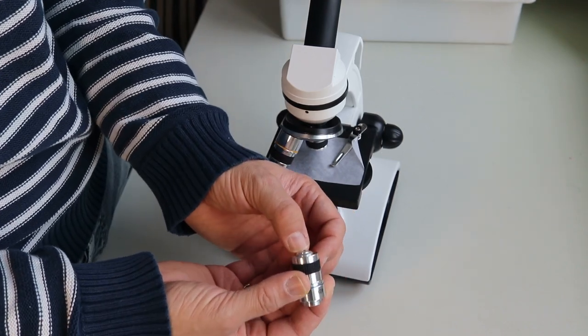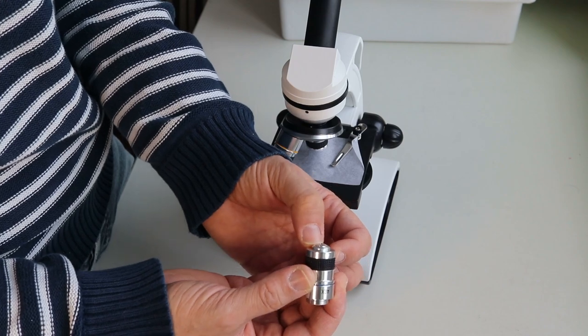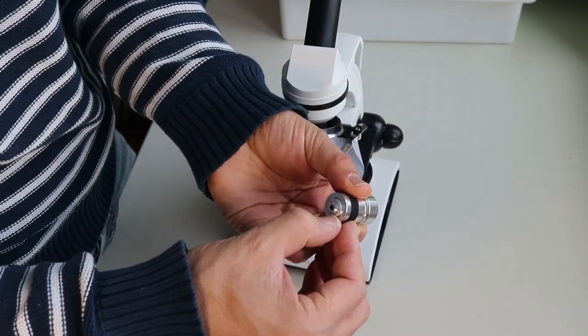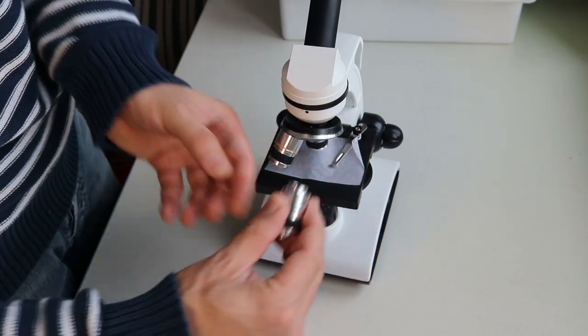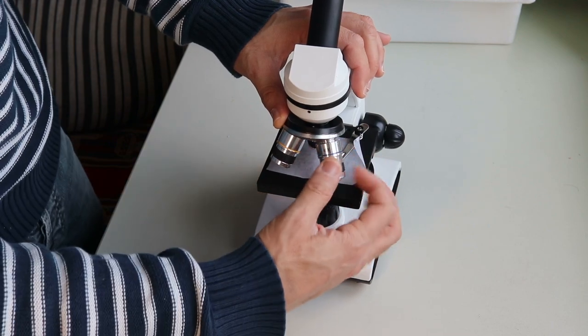Oh, look at this! Huh, it's spring-loaded, okay? That's an interesting one, a spring-loaded objective. This is a protection system, in case you crash the objective into the slide, so that the objective and the slide are not damaged. For such a low-cost microscope like this one here, a spring-loaded objective, that's quite something. Okay, so let's put it in again.